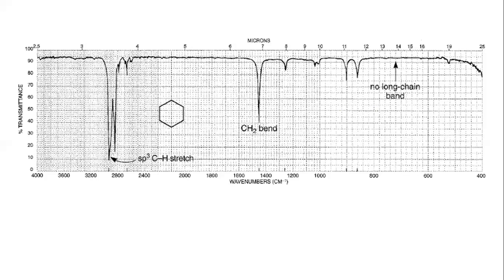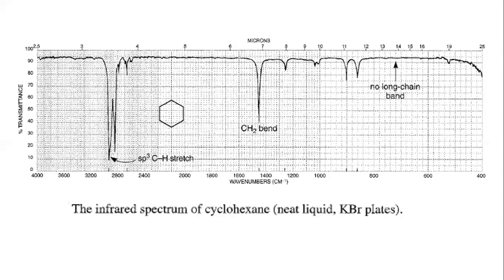So maybe he had drawn a line in a haphazard manner, but that's not the answer. Basically, there is a lot of hidden information in this plot. And what's this? You have studied it for a long time. That is cyclohexane. Spectroscopy can tell us about a specific compound. If there is any impurity in the compound, the peak shape must not be the same as it is now. But if you get only a single spectrum like this, it means your compound is pure.